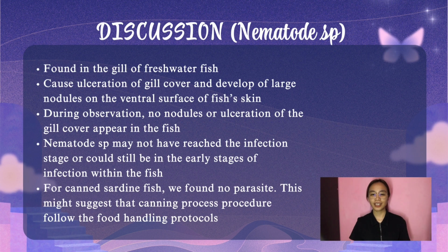We move to the discussion. During the observation, we found a nematode species on freshwater fish, which inhabits the gill of the fish.